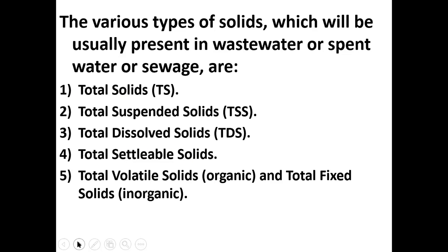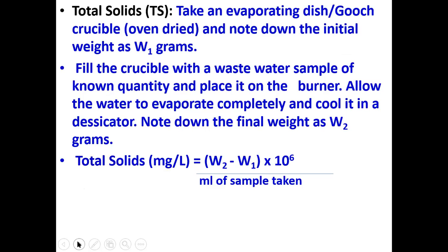As well as total fixed solids, which are inorganic in nature. Now let's see one by one how to analyze them. If you want to analyze total solids in the wastewater, you take an evaporating dish or Gooch crucible. This will withstand elevated temperatures.